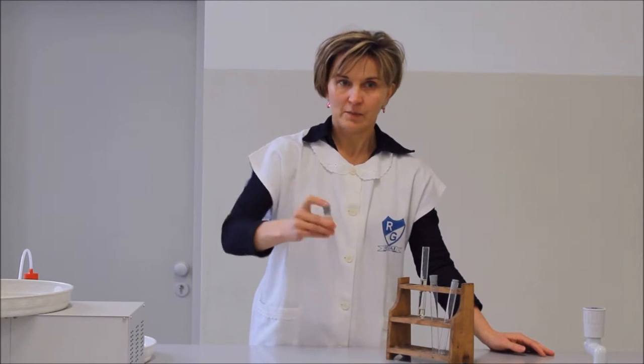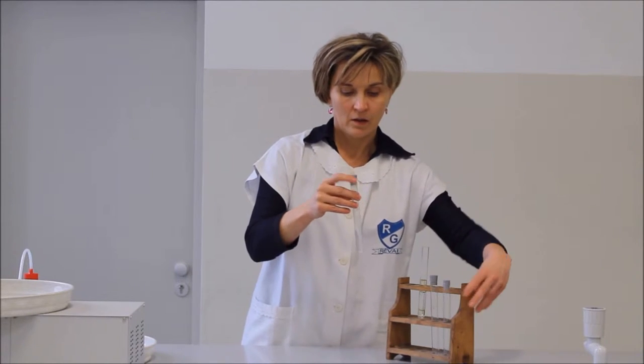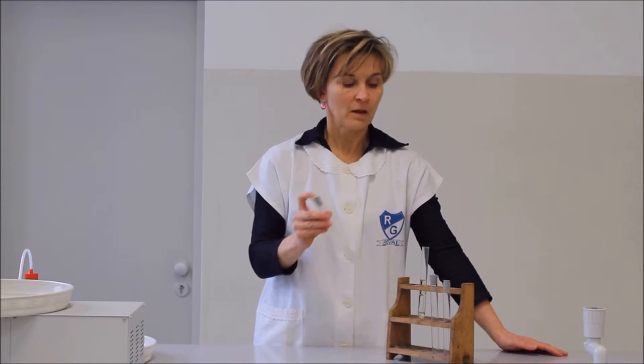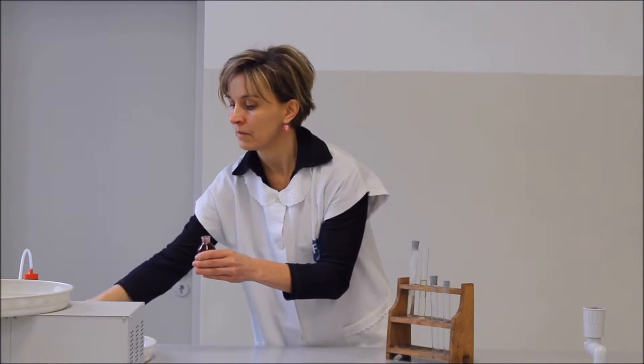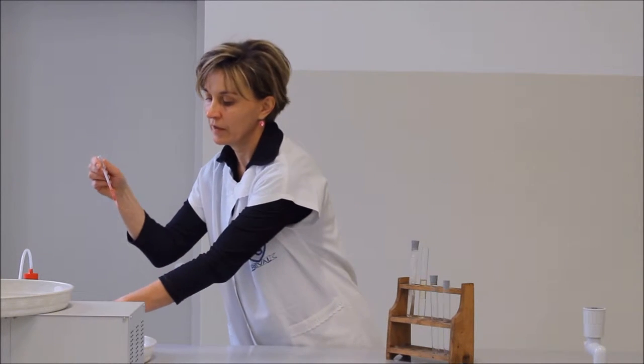Összerázzuk a kémcső tartalmát, és megfigyelhető, hogy a disznózsír nem oldódik a vízben. Az étolajat helyezzük a vízre, ebbe teszünk pár csepp sudán 3-festéket.